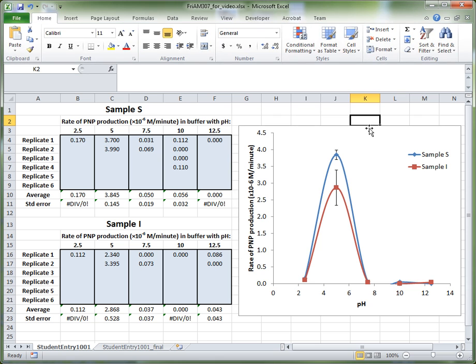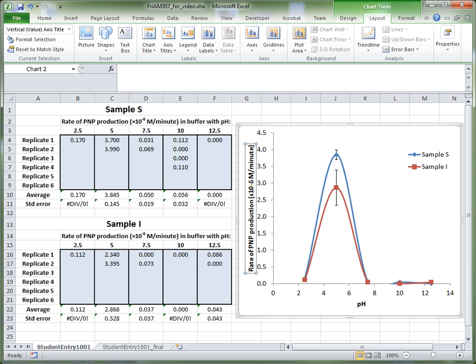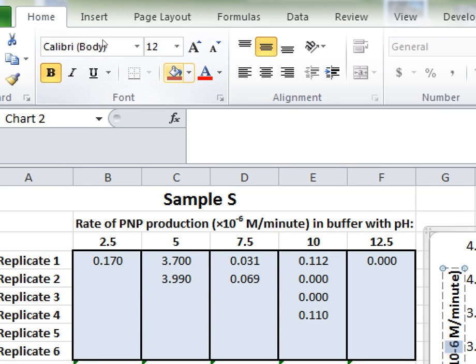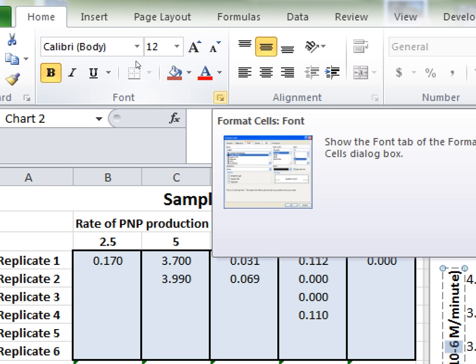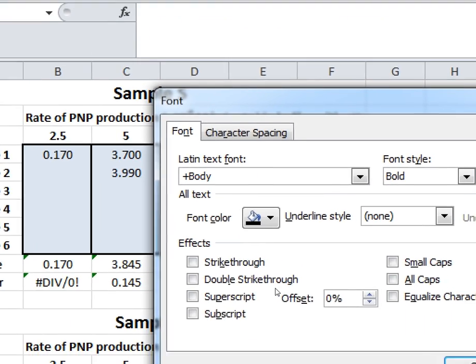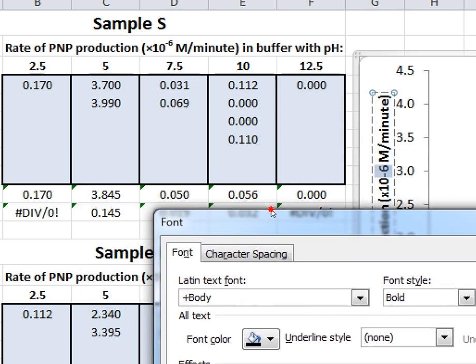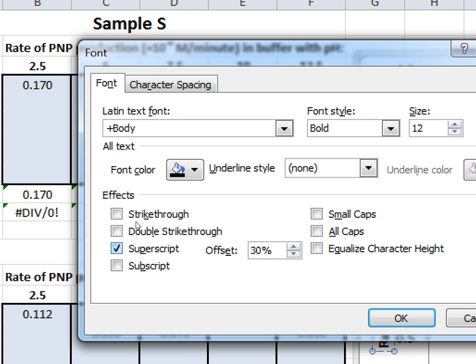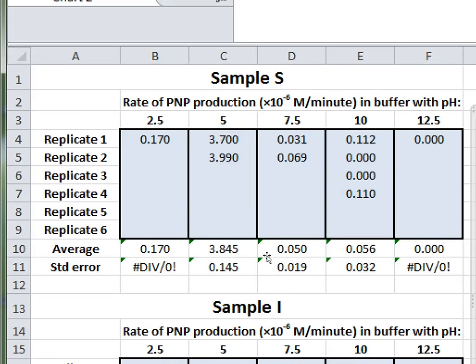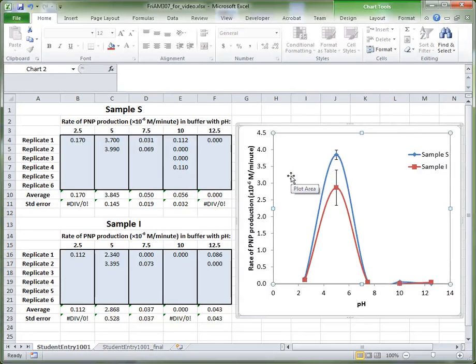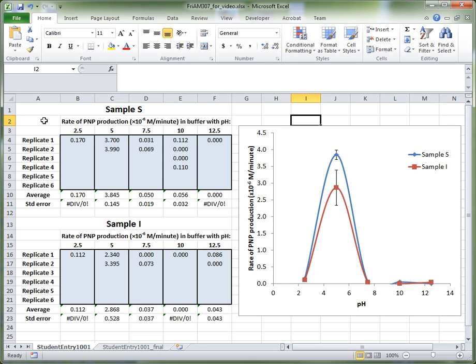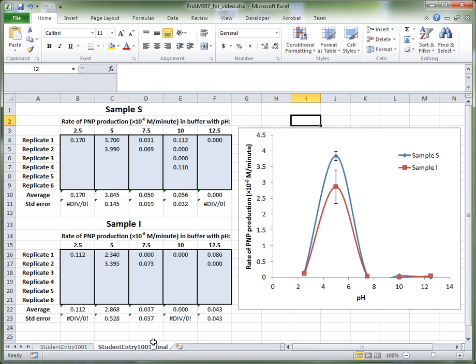Essentially what we have here is the finished graph. One final thing to tidy up: the '10 to the minus 6' in the axis label — you can make the minus 6 a superscript. To do that, select the minus 6, go to the Home tab, click the small Font dialog button, and in the options that appear select Superscript, then click OK. That will render the 10 to the minus 6 correctly in superscript. So what we've seen is how to use the XY scatter option in Excel to plot a graph of our enzyme activity, and we've created essentially what we wanted.